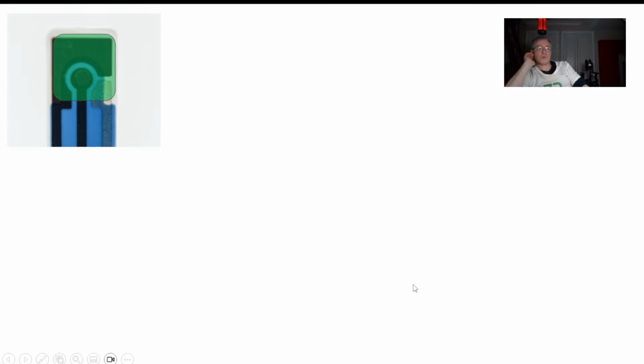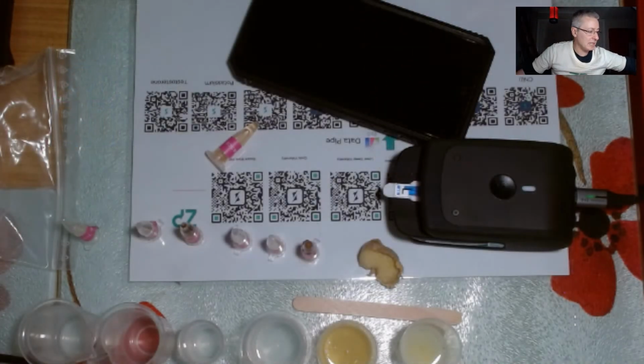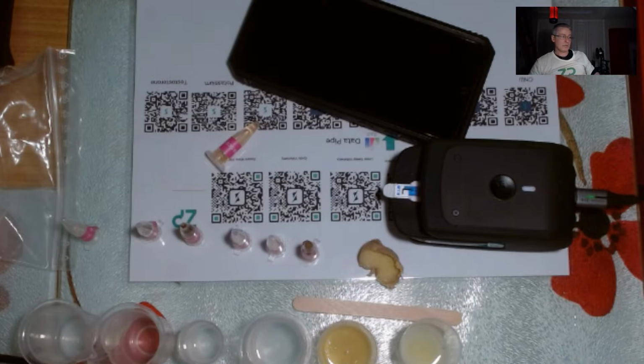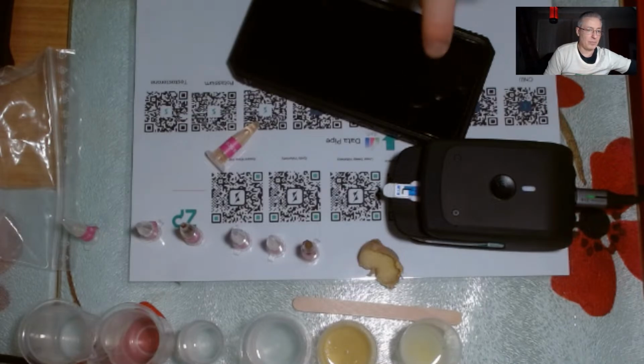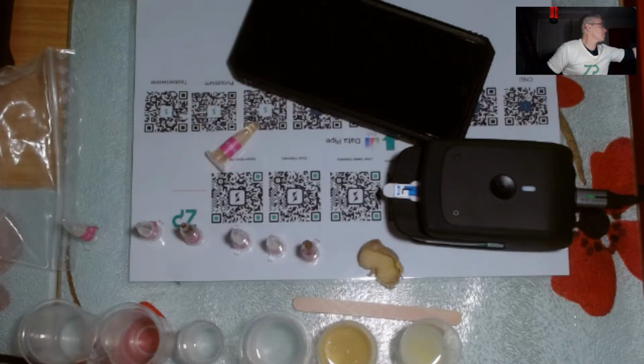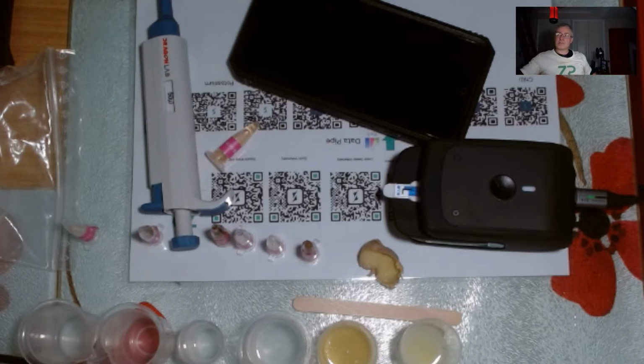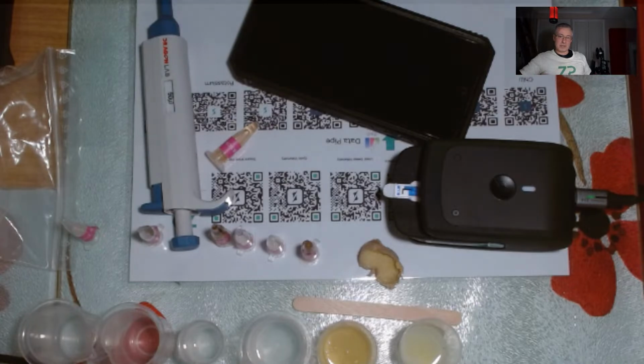Just out of interest, people who would be using this form factor will be testing, and in fact I'll be doing a test in a minute, so hang on and you'll be able to watch something like that. But when you're testing by putting drops on these kinds of sensors, and in fact I'll get a pipette tip while I go along, you're often working in what we call a non-steady state situation. So I'm going to bring that up just to explain what I mean by that.